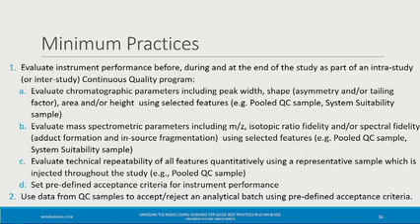And so far, as I see it, we are using the QCs for basic post-analytical work, like to control for features and filtering, variation, and so on. So from my perspective, it makes more sense to pool the QCs afterwards, because then you are really sure that in all the vials or in all the injection replicates you have exactly the same thing, and you can control better for the instrumental variation.